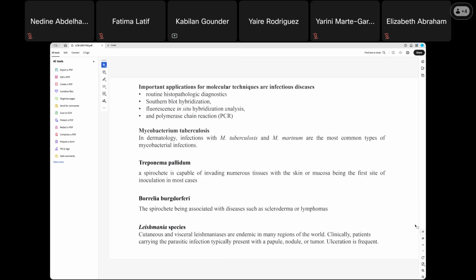So these are all the basic downstream applications, which help to identify novel genes, for diagnosis purposes and also treatment options, so that the isolation of cells gives you reliable treatment options. So with this, we completed the laser capture microdissection technique. The next one is the scanning electron microscope and the electron microscope.